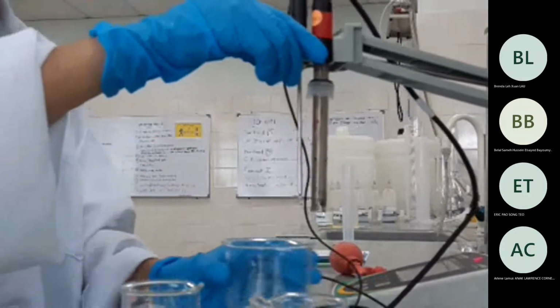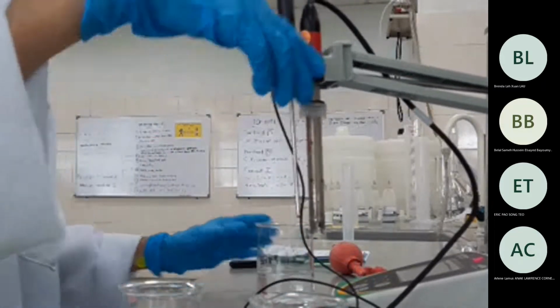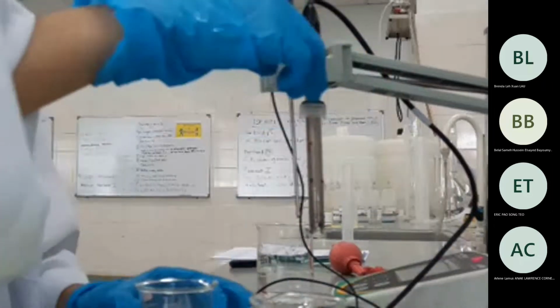Mixing the 100 together, then we put 25 to each. Have you washed?